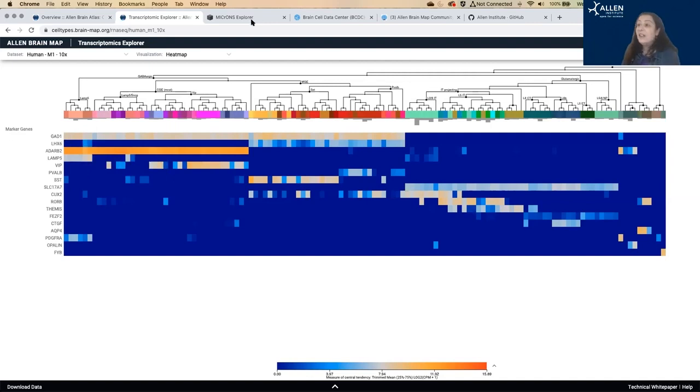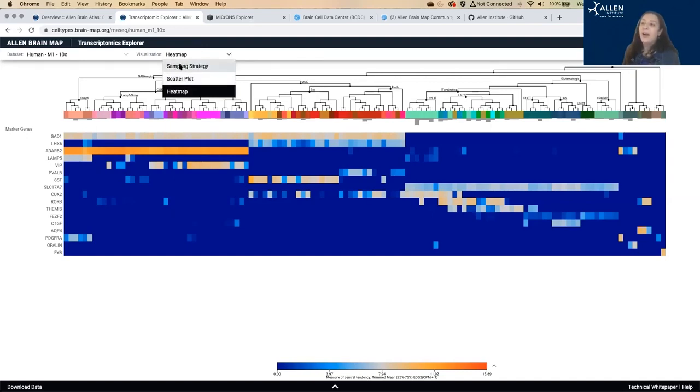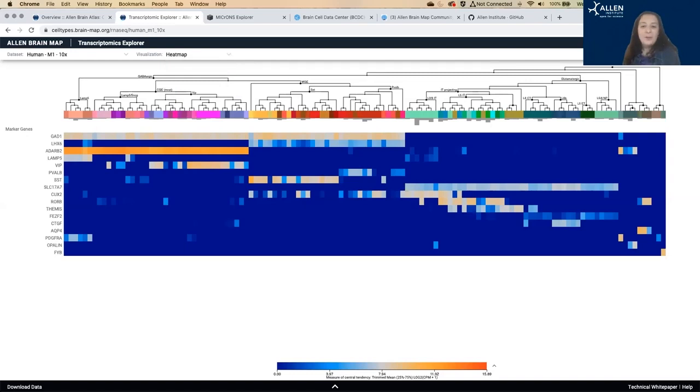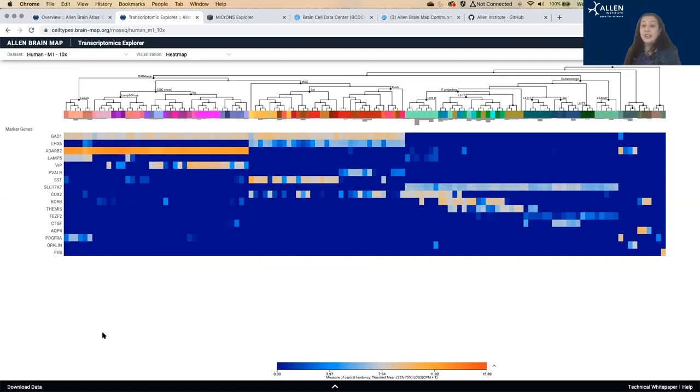And you can get the sample sizes here by looking at the sampling strategy box. So again, we have determined through our research that these are the genes that most contribute to distinguishing cell types from each other.